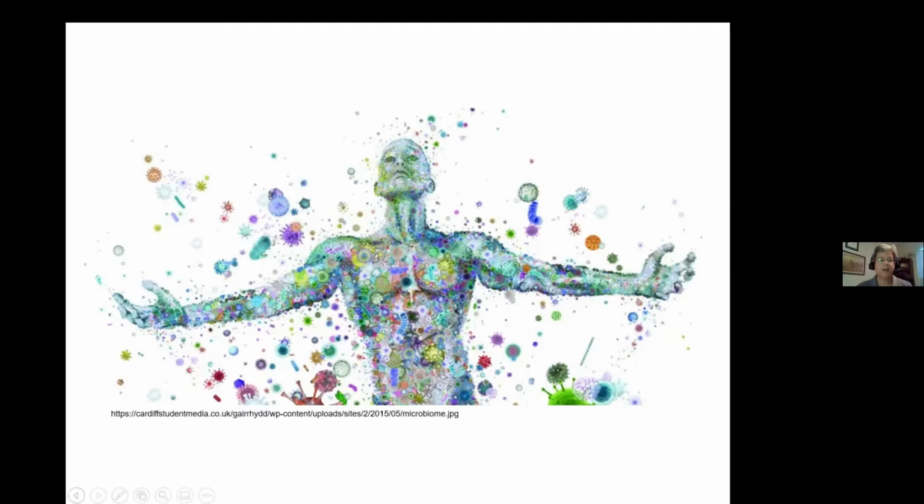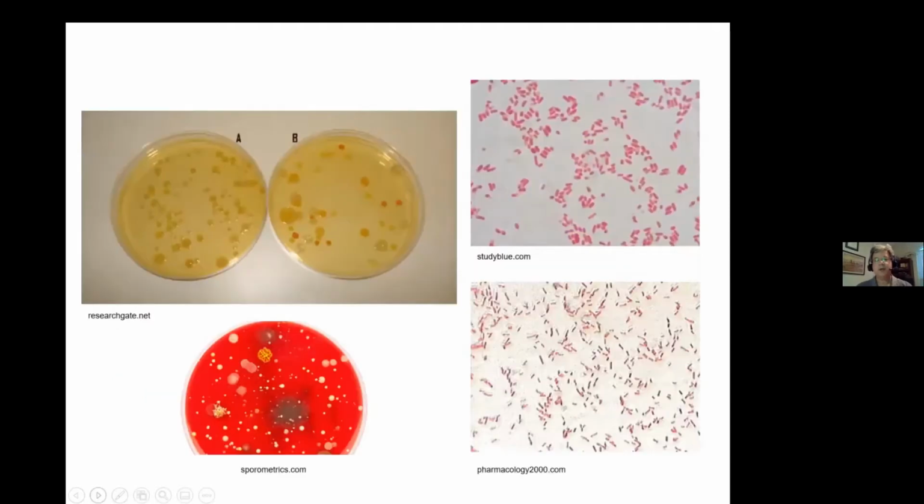But if you take a sample and you grow them up, yeah, maybe those look kind of different, right? They're different colors, but pretty much if you just go by what they look like, there's maybe three things there. And maybe there's a little more on this plate, but a lot of them look exactly the same. And even if you look at them under the microscope, they look the same.